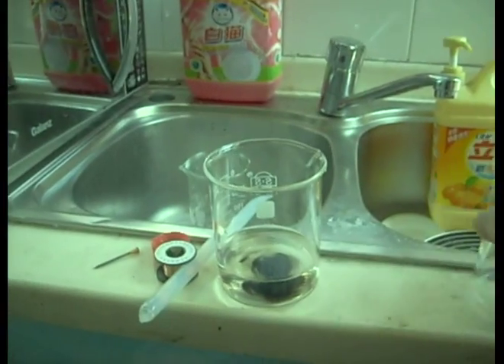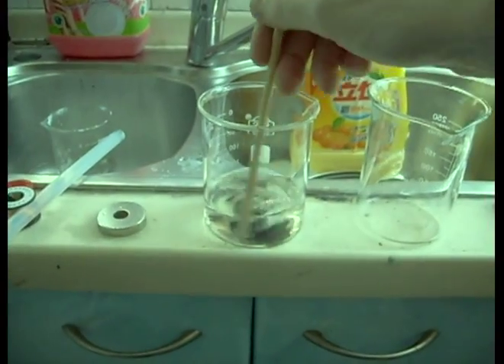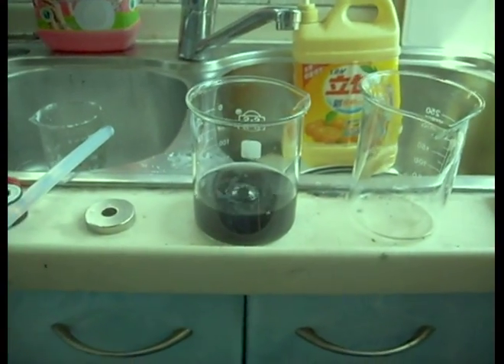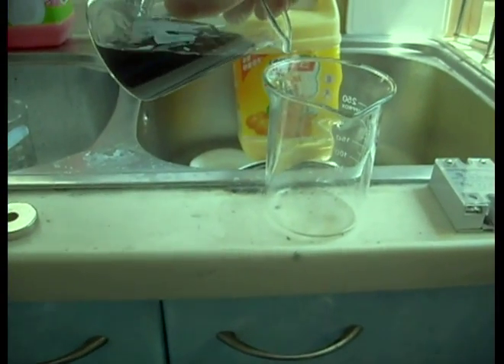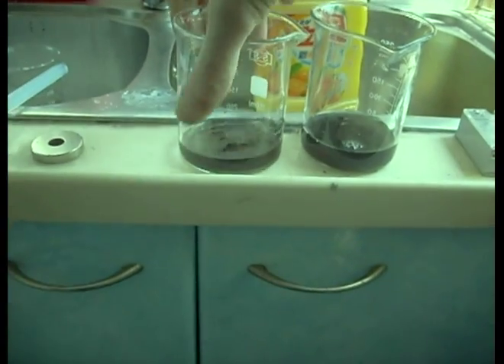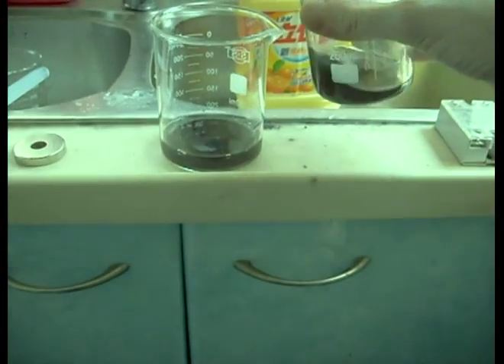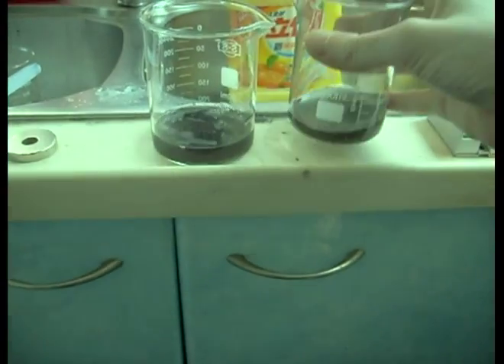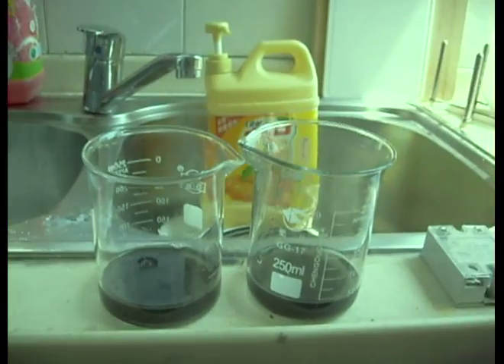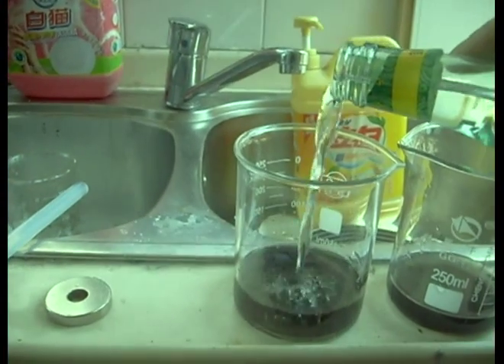Now for the next one, we're going to mix it up. We're going to do two more, so we're going to divide this into two. Get it good and mixed up and split it. Now we're going to boil this one down with a whole bunch of vinegar added to it.